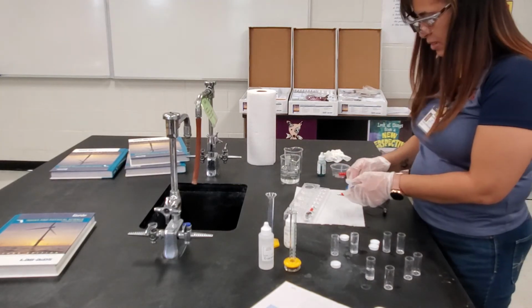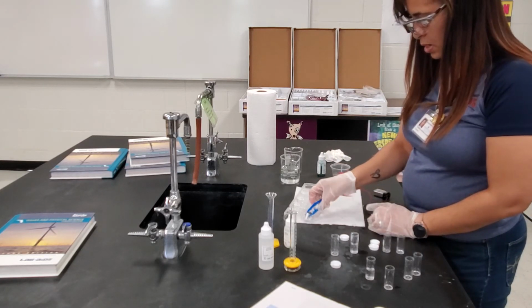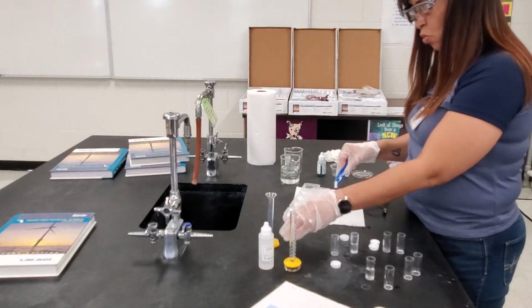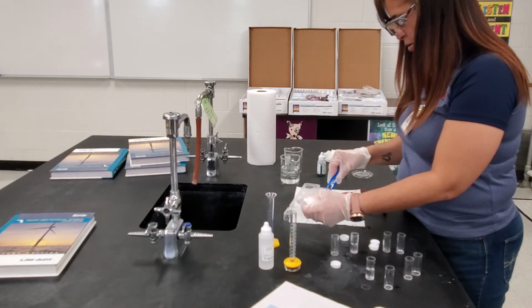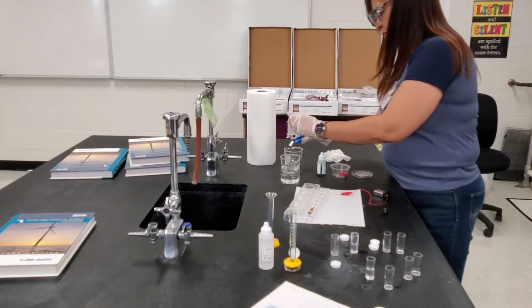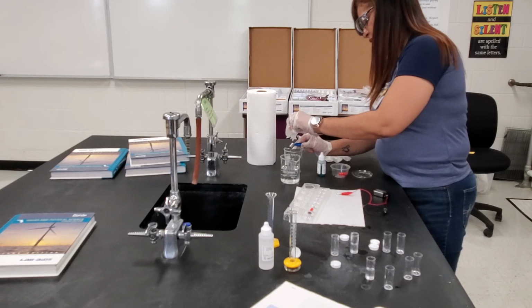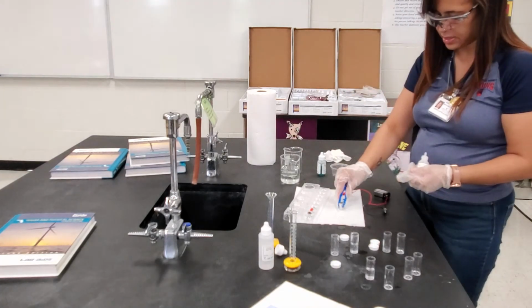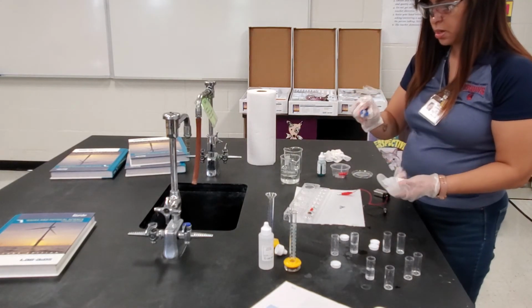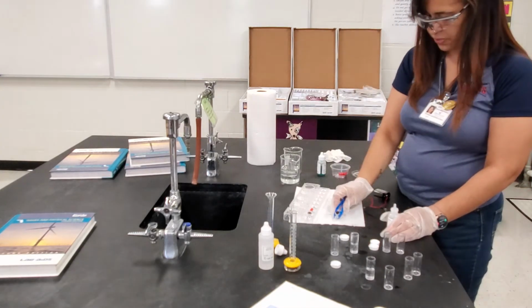So I'm going to take the metal piece out to see what it looks like. And I'm going to go ahead and rinse it off in some water. I'm going to take my water here. And I'm going to rinse it off. And it definitely produced a reaction, because this now is what my metal piece looks like from this pretty shiny silver.